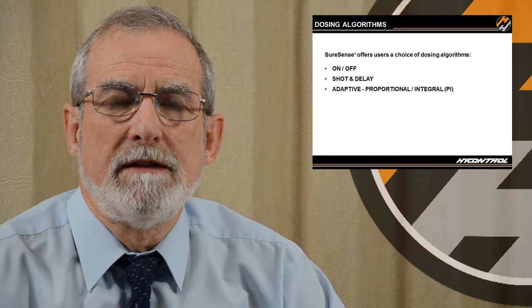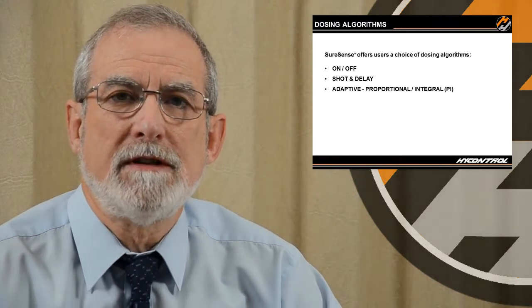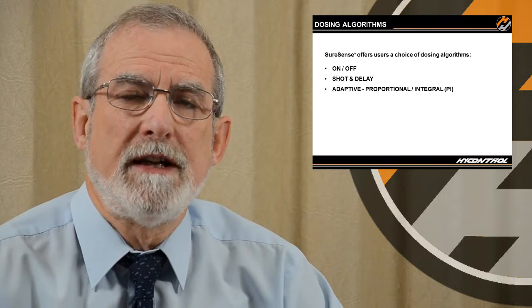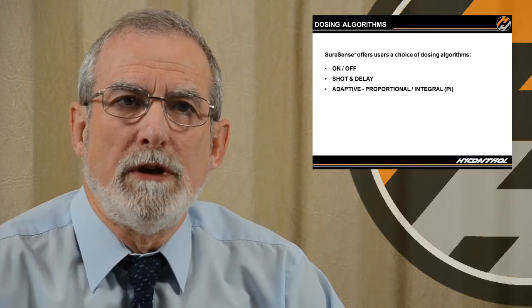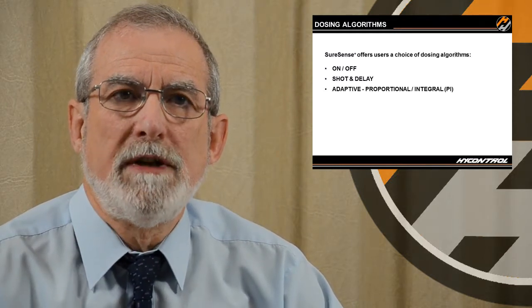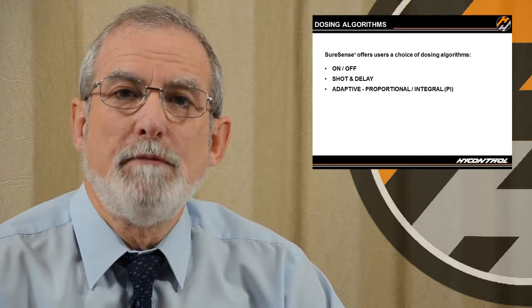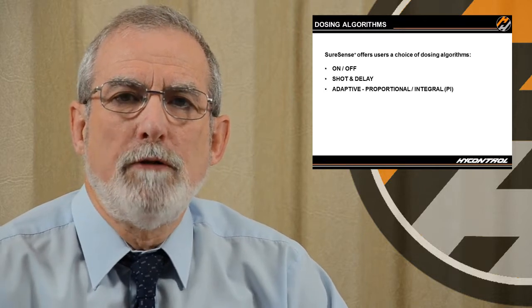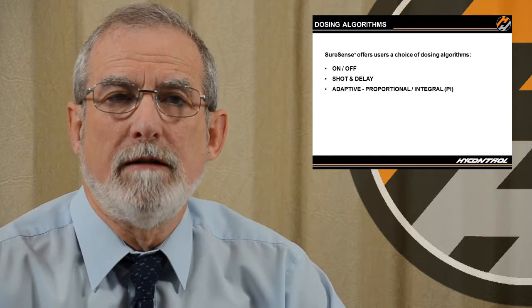And we're attempting to get the foam measurement to match the set point that we've put in. So if we want foam at 50% measurement, we'll adjust the foam by means of adding antifoam until the foam measurement matches the set point. When the foam measurement goes over the set point, it's because the foam's rising up higher.